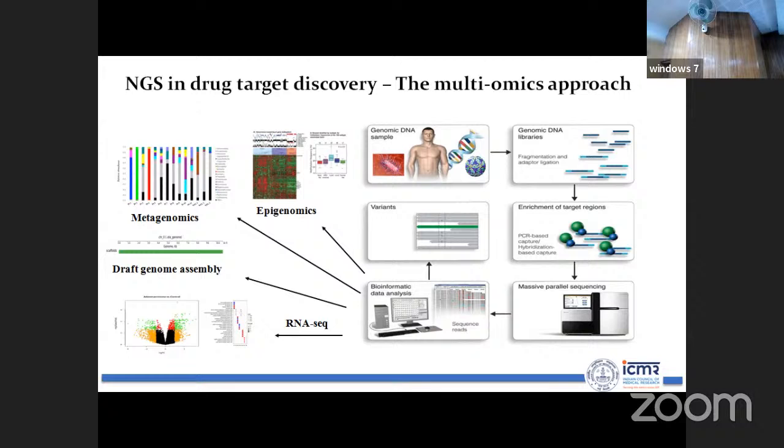Let me tell you, we are not comparing genomes directly. In NGS, we will be getting reads, which are of length 150 bases only. I'll be coming to those things in my slides. When you go for variant calling, you will get, say, 10,000 variants for the drug resistance trait. As you know, in NCBI there is a reference genome already there. So you are not comparing drug resistance versus drug susceptible directly. You are comparing drug resistance with the NCBI reference, and drug susceptible with the NCBI reference.